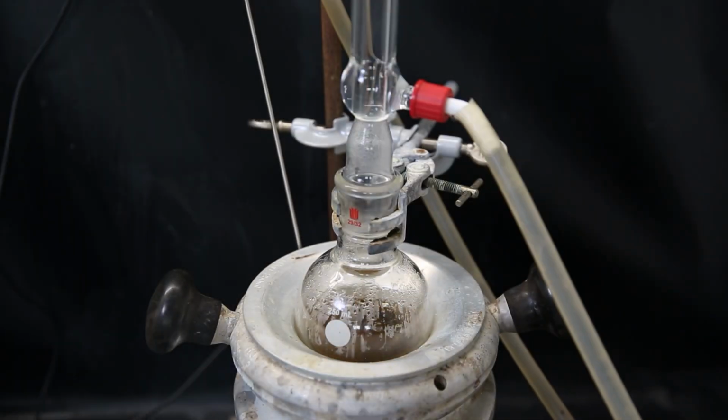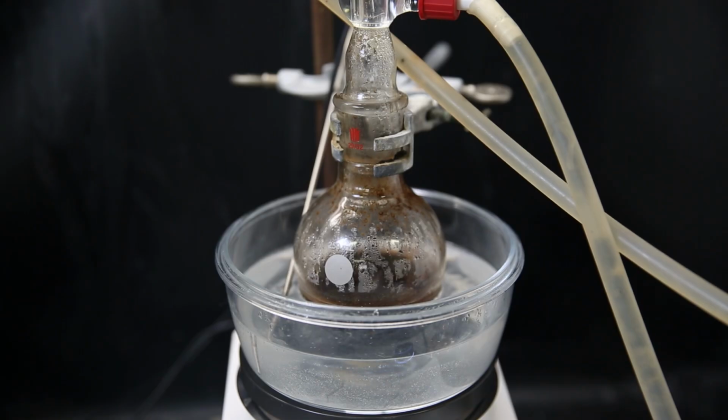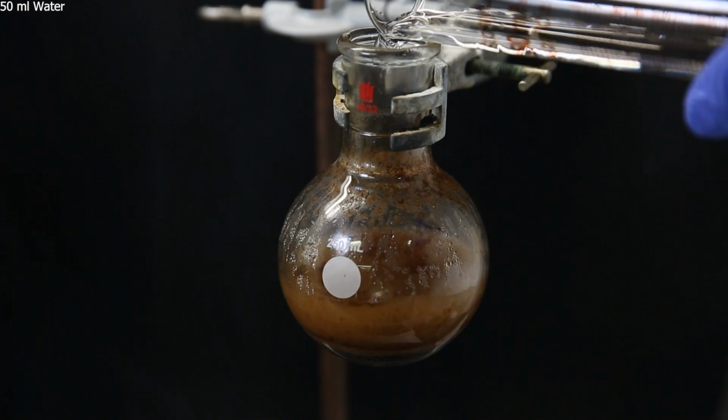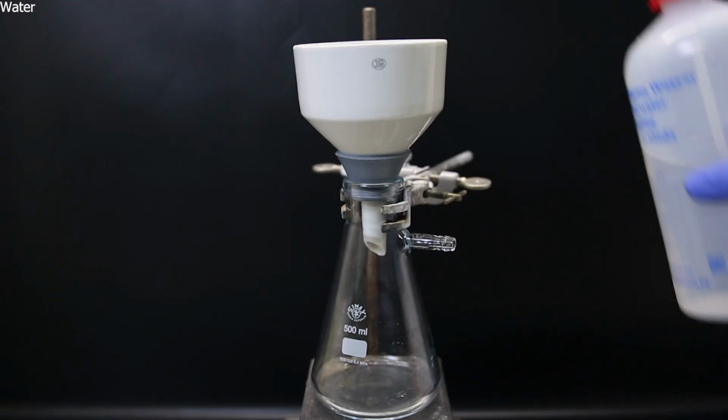I checked back the next day and it has turned brown. I used a hot water bath to continue on, and after 4 days it has turned slightly darker and the reaction should be finished. I take it out of the water bath and remove the condenser. I then dilute it with 50 ml of water. I then set it up for vacuum filtration.